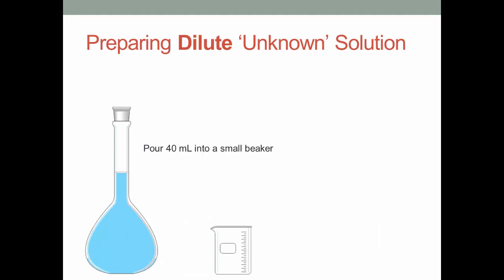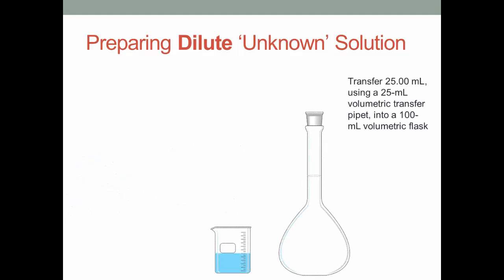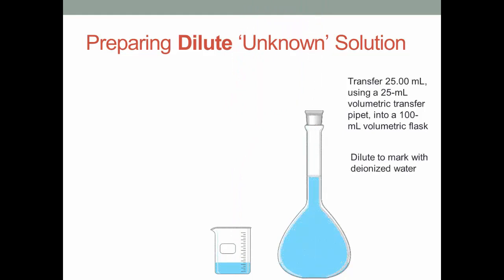Next, we will prepare a dilute unknown solution from our dissolved multivitamin. Pour 40 ml of the multivitamin solution into a small beaker. Then, transfer 25 ml using a 25 ml volumetric transfer pipette into a 100 ml volumetric flask. Dilute to the mark with deionized water, and remember to mix well.